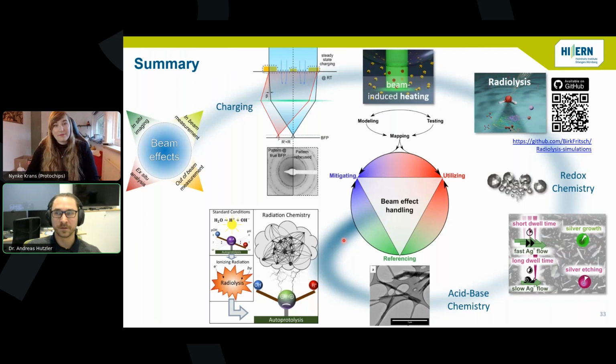You could also, I mean, everything is not optimal right now. You could also go to graphene liquid cells or very thin liquid layers, but those have the same issues in principle. Yeah. Clear. Thank you.